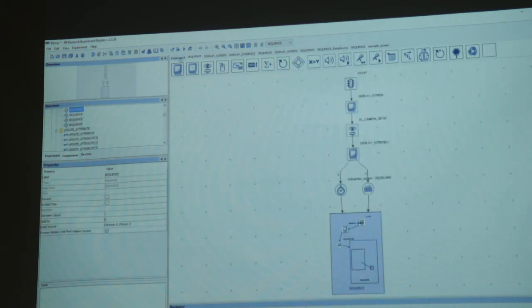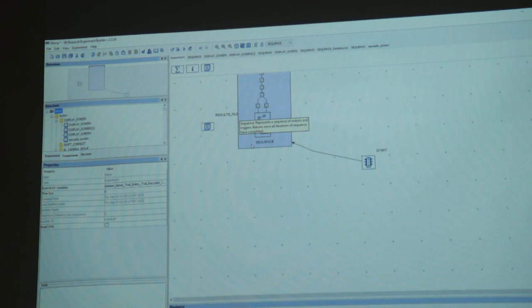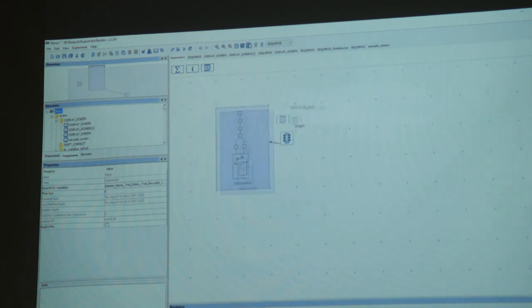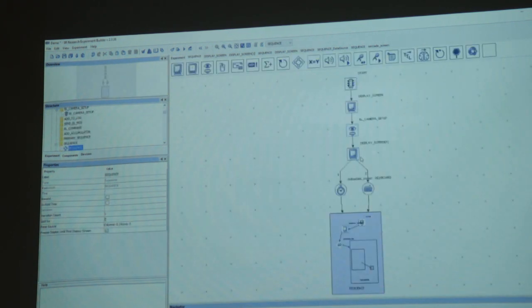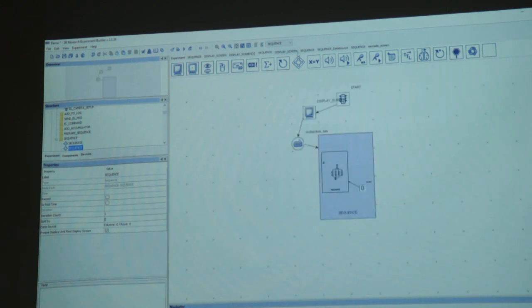So I will just go through what we built so far. First layer has a start, a big whatever window and a result file. This is from the others, mind you, not the action, others. You see what I'm talking about? The categories here on the set. Okay, you double click this. Now we have our calibration. Now we get inside. Then we have instruction.